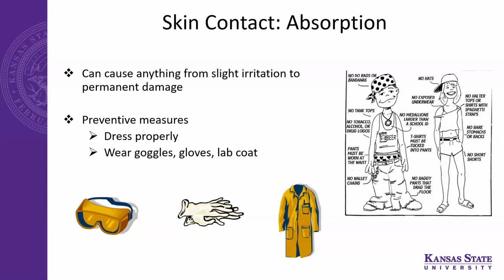As I said, the other thing I was going to mention is the hair. Hair should be tied back always. There's this misconception among students, and even some of our TAs, that hair should be tied back only when flames, like Bunsen burners, are in use, which is not true. Because in a chemistry lab, you are dealing with chemicals, so accidents can happen at any time.